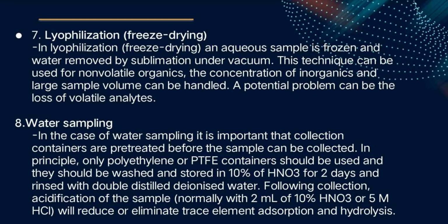Next, lyophilization or freeze drying. An aqueous sample is frozen and water removed by sublimation under vacuum. This technique can be used for non-volatile organics. The concentration of inorganics and large sample volumes can be handled. A potential problem can be the loss of volatile analytes.